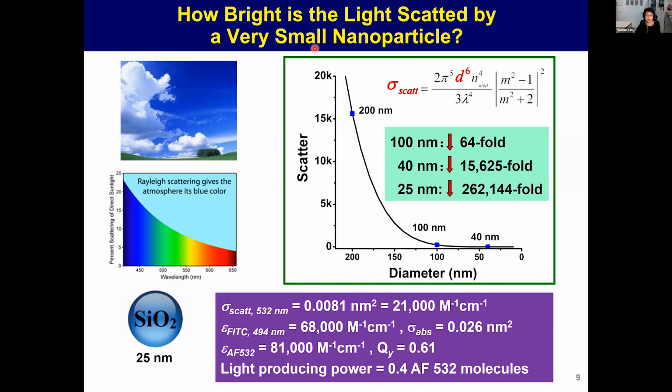Fortunately, but I also want to highlight, actually this is a very challenging task because based on the Rayleigh scattering theory, the scattered light intensity of single particles scales with the 6th power dependence of particle size, which means with the particle size decrease, the intensity will soon drop below the background.